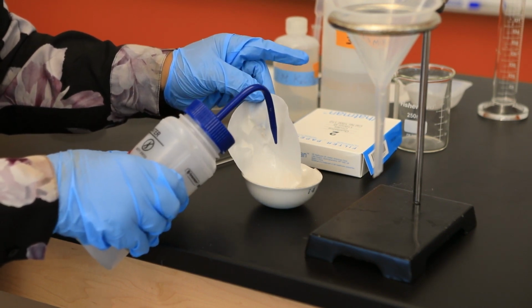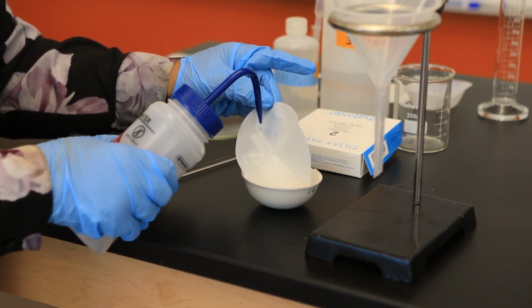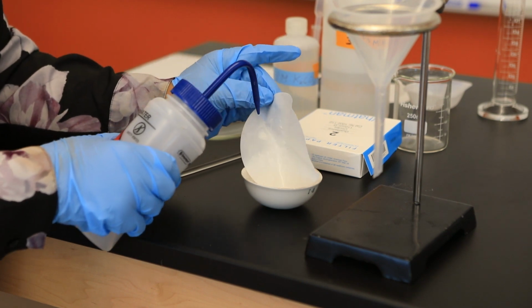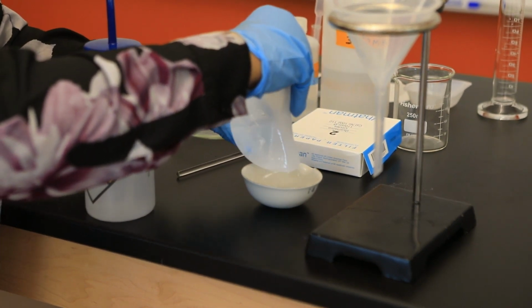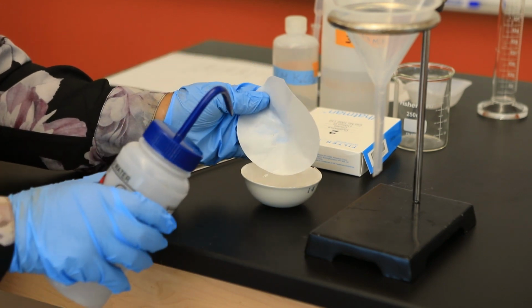I want to use not too much water because at the end I'm going to have to pour off. What do I mean by that? That means I just have to decant the H2O. But I need to be careful and make sure that I remove all of my solid.